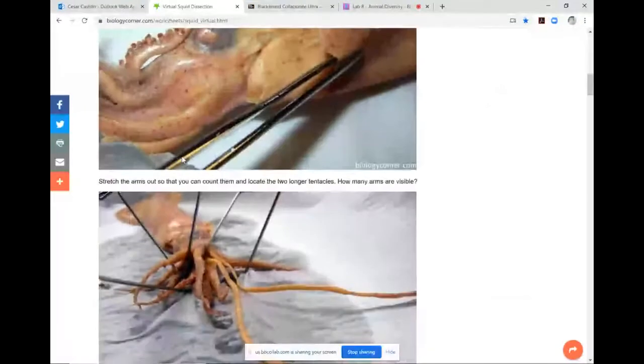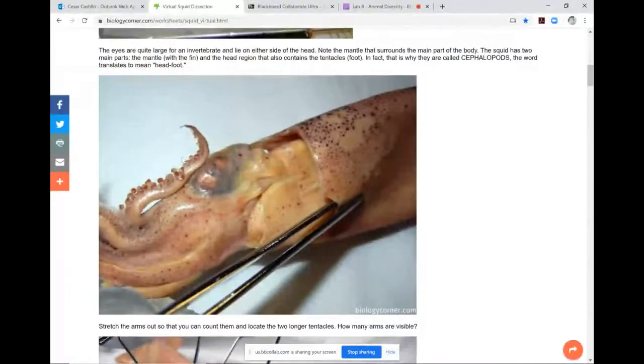All right. So here we have the head of the squid. This structure here with a little slit there, that's the funnel or siphon. Here is the mantle. This is an eye. Remember I told you the squid have very well-developed nervous systems, and that includes the eye.